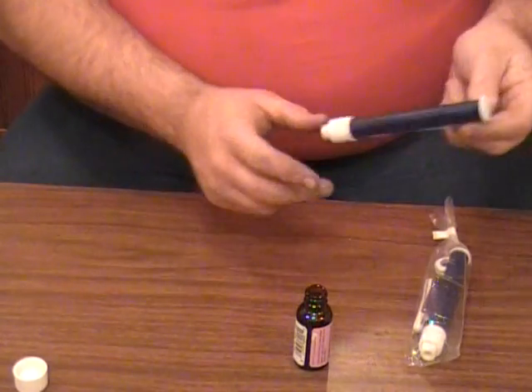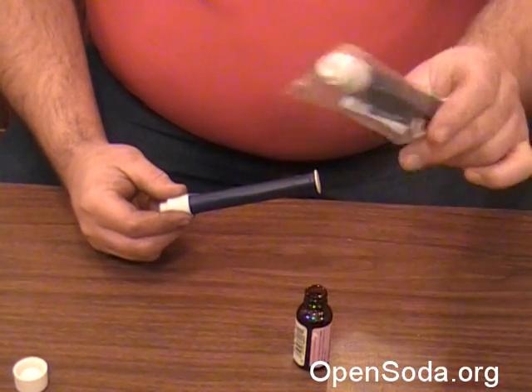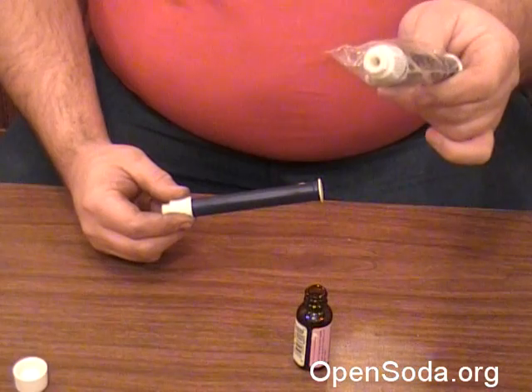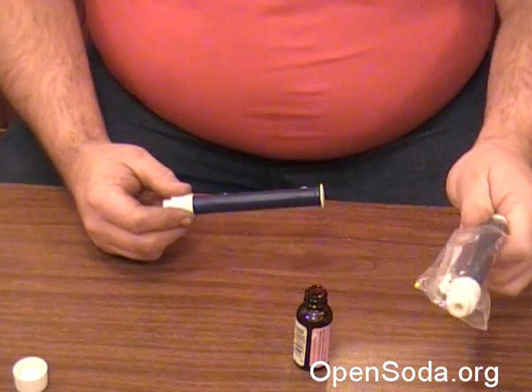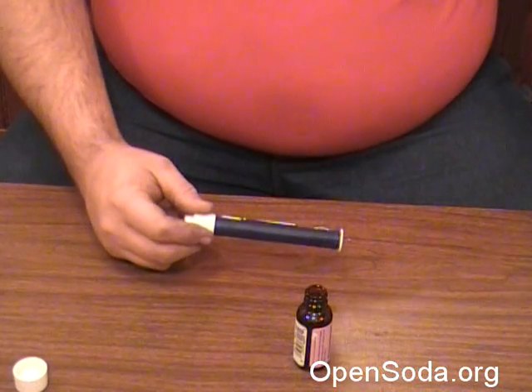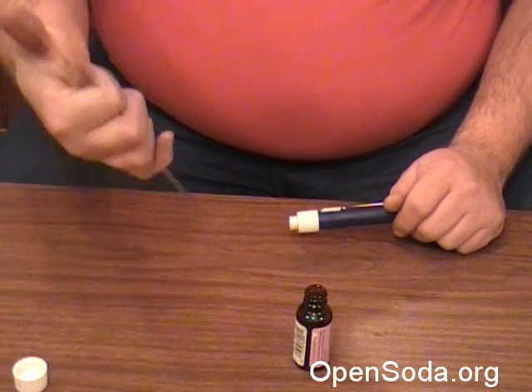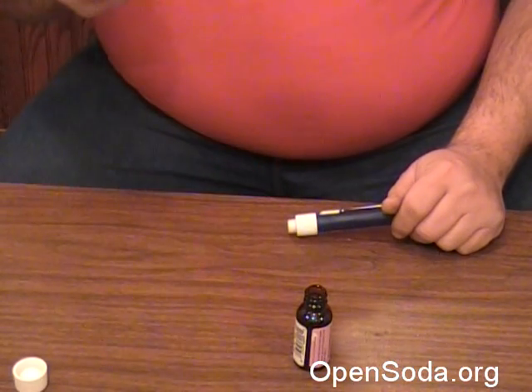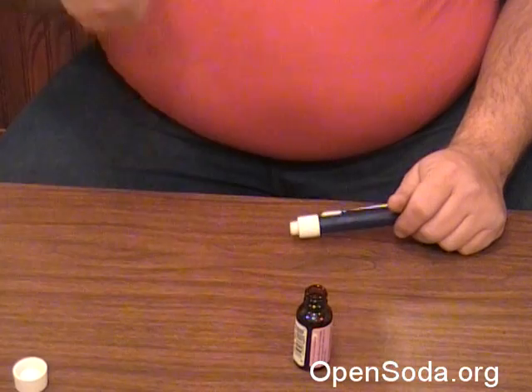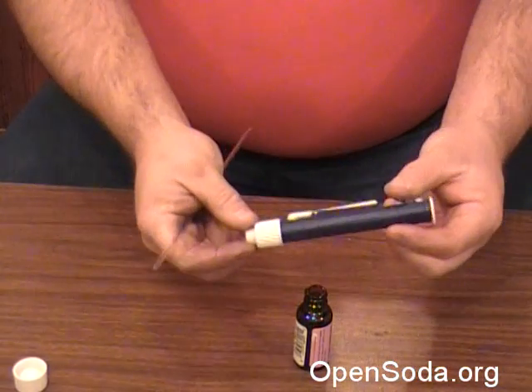Today I got this new pipette pump — I got two of them here. These things are really cool, the awesomest things. We used to use that little squeeze bulb or just stick our thumb on the top of the pipette to measure the oils. Highly inaccurate, and I knew there was a better solution out there, so I found these pipette pumps.